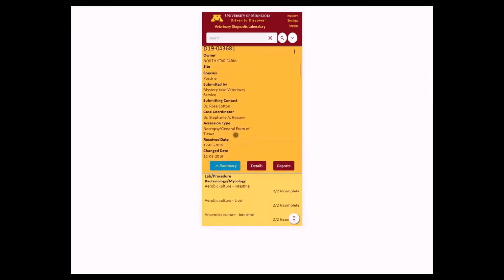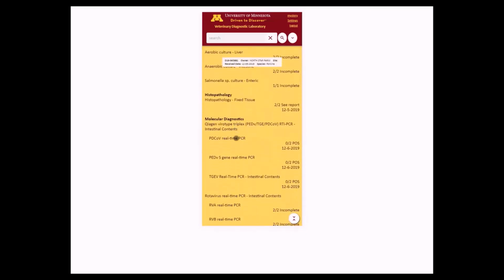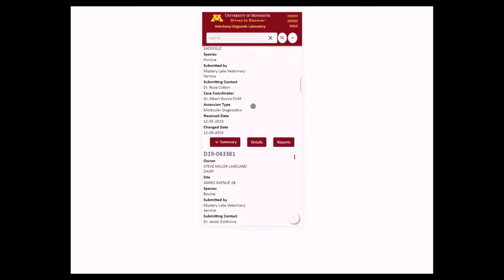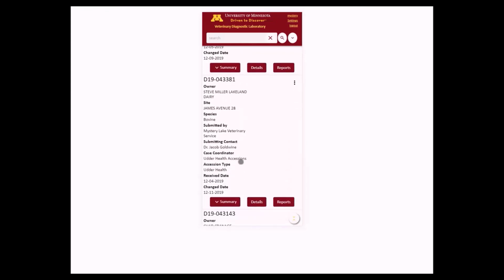The floating fields are similar in that if you go beyond the demographics of the header tile, it will show you the information that you set in your settings as the floating field. If you're in the middle here and you don't want to go back to the top of the case, you can just click the close all button, and it will close those summary displays so that you can go forward. Many of the things are similar, and so I won't go through everything.